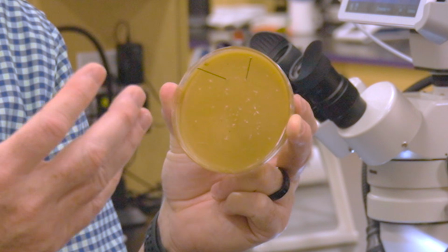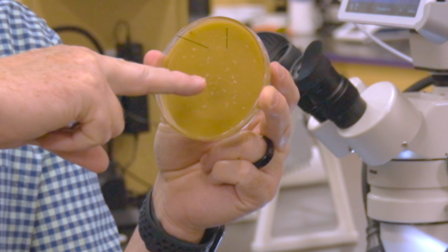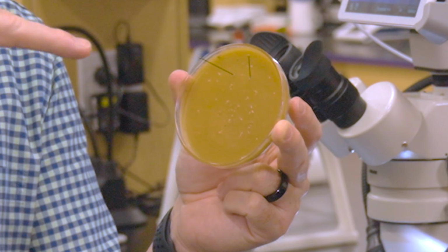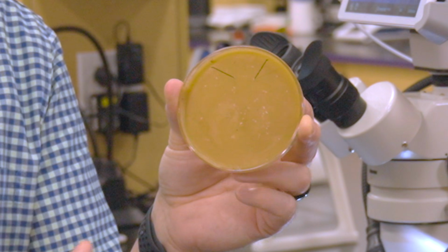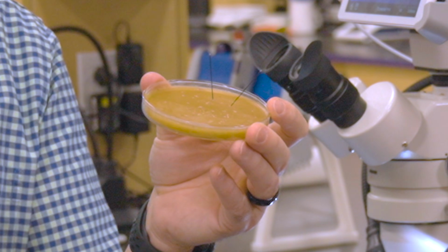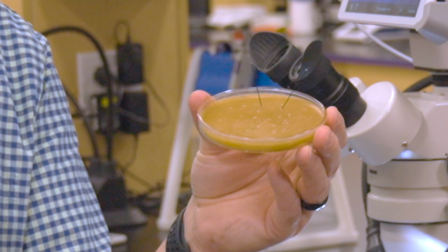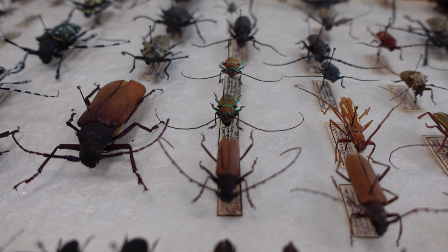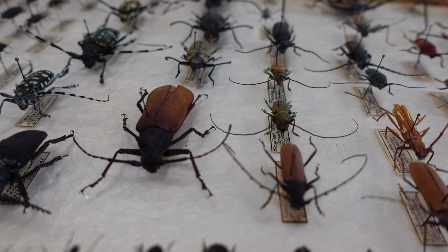We melted some beeswax, we put into here, and that beeswax allows us to push pins through the bee and secure those bees into that beeswax. It's a nice little cheat for you when you're developing something into which you can place bees. Now, I said the word pin, so in order to pin bees into the beeswax, you're going to need pins. These happen to be insect pins.